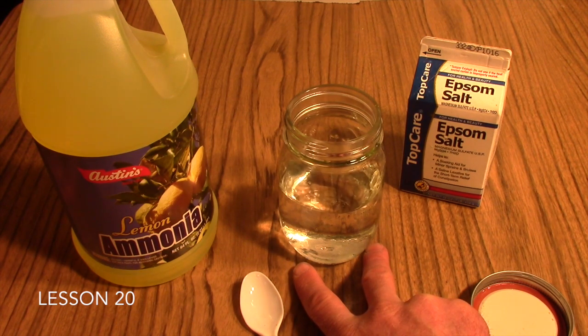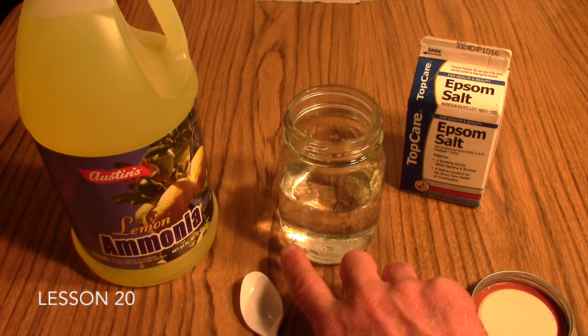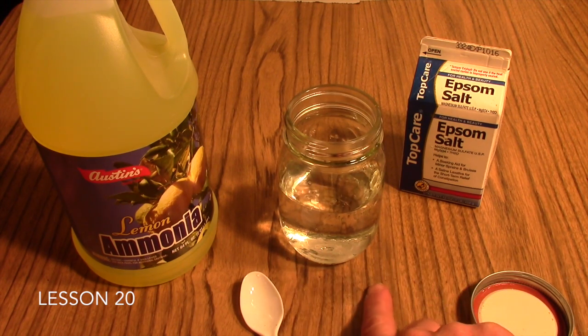Theoretically, you can pour off the water and then evaporate any remaining water to be left with just a powdery substance, which is now magnesium hydroxide. This is the Formation of a Precipitate lab, which goes with Lesson 20 in your Friendly Chemistry course. The formation of a precipitate is evidence that a chemical change has taken place.